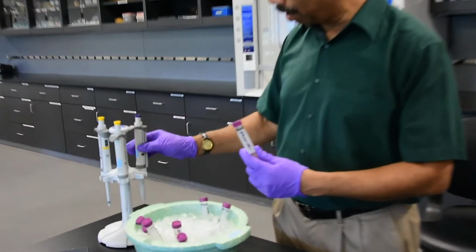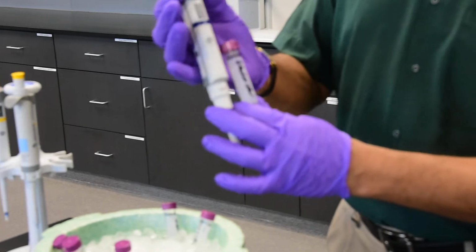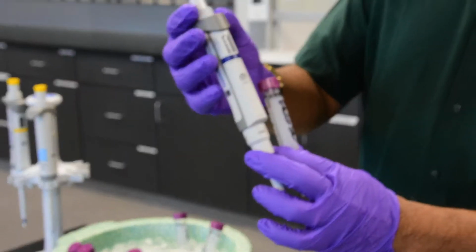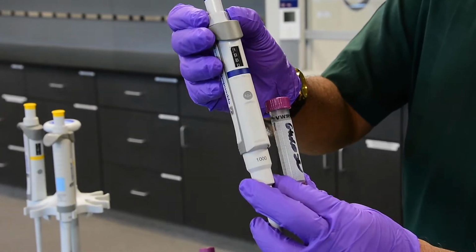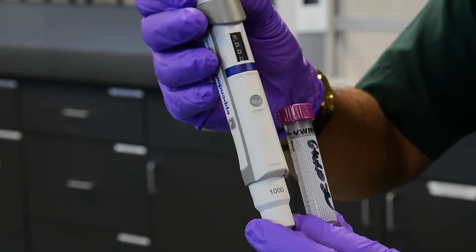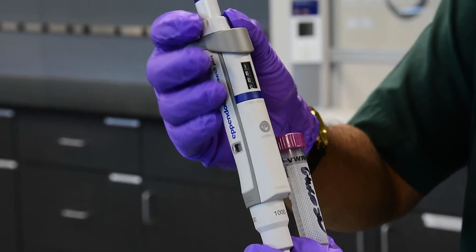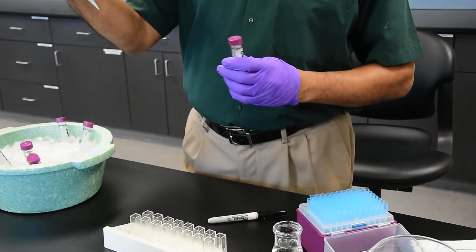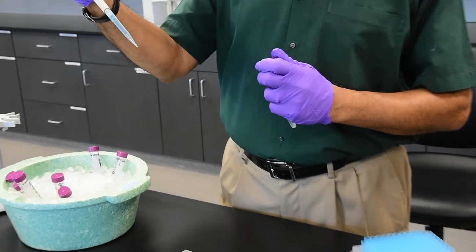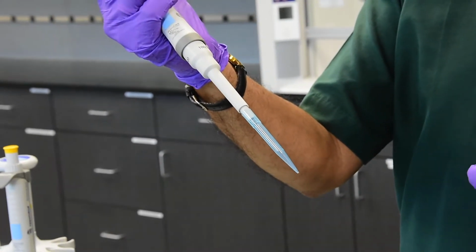So this is the stock, and here's the micropipetter. With the micropipetter, you can set it up with the dial on the top, and you can change this. Now it reads 1000. That is going to measure 1000 microliters, equal to 1 milliliter. So I'm going to use a blue tip for this micropipetter, and the blue tip protects the micropipetter from being contaminated, and that is the right way of using this.